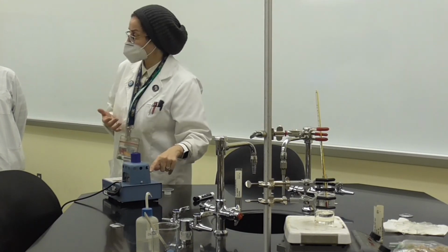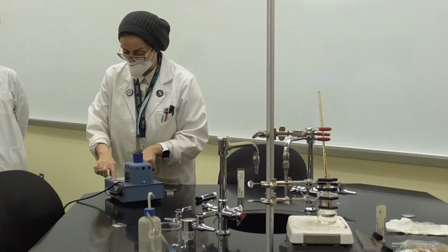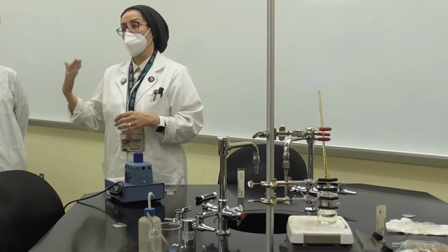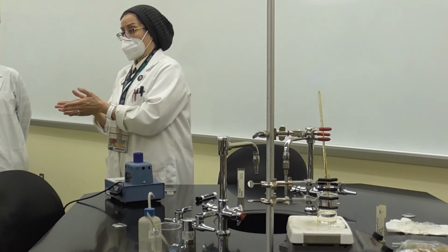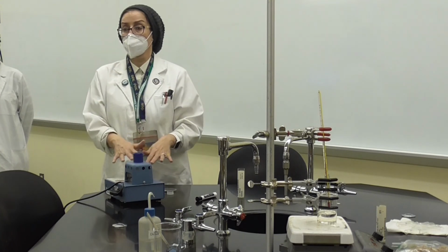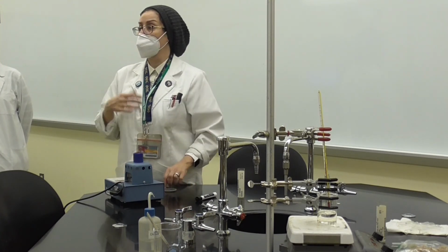You have to be careful. You don't want to miss it, all right? The digital screen is going to show you the melting point as it increases. So we know in advance the melting points of those chemicals and what we expect here in person. This is what we're going to do with the melting point.